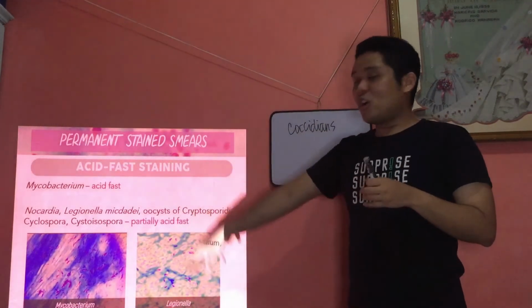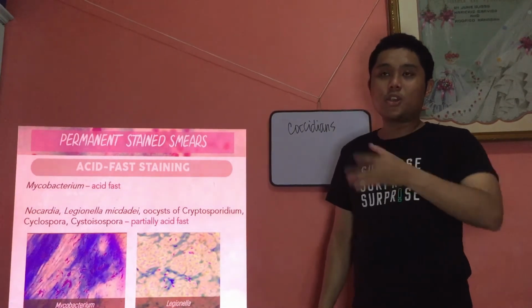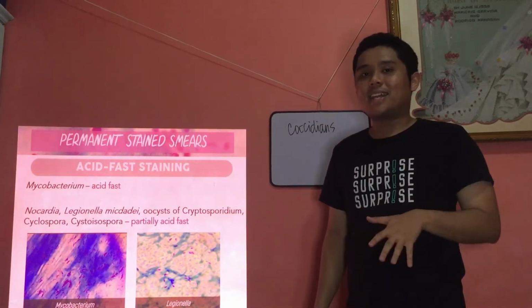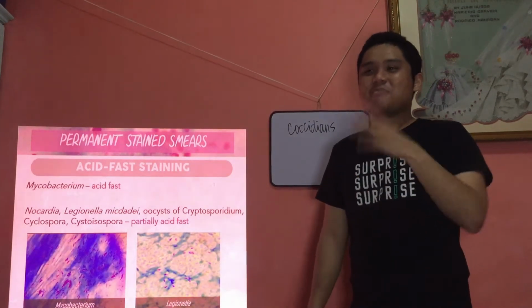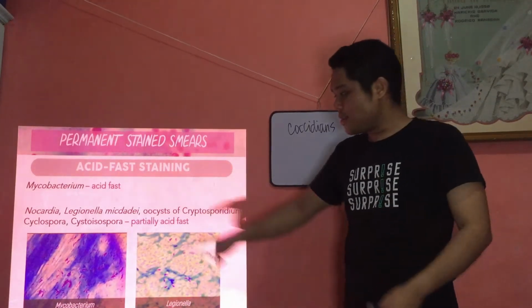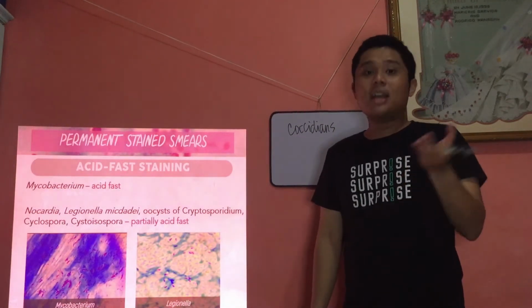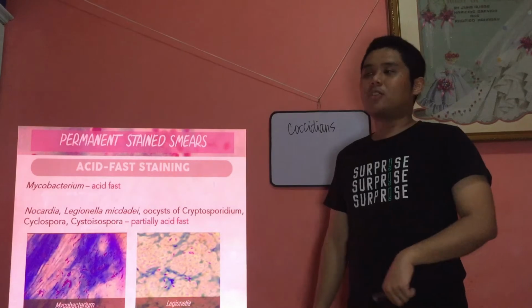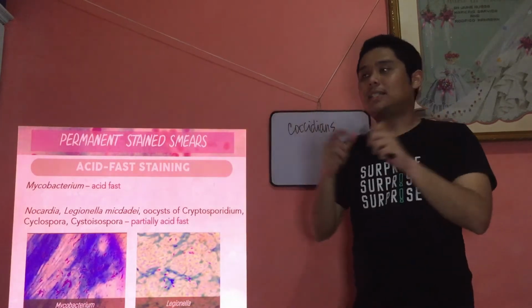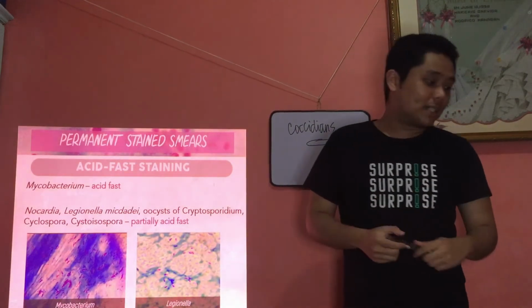So, in your bacteriology, you'll know that there's a grading for that. For the results, when you read slides for acid-fast for Mycobacterium tuberculosis, there is a grading. And I will not discuss that here, okay? That's for bacteriology. So, just to give you a glimpse. The red ones there, they are your Mycobacterium tuberculosis, the causative agent of your TB, and they're colored red. Later you'll know, they are bacilli, they are rods, rod-shaped bacteria.